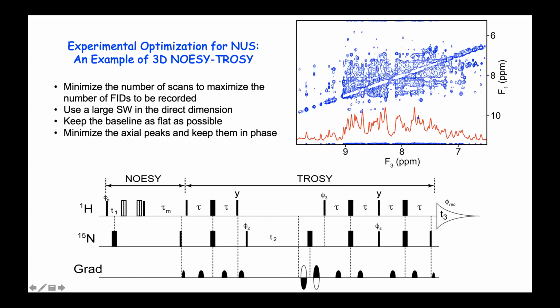So whether this phi 1 is real or imaginary, meaning that you either acquire sine or cosine, you get the same amount of T1 relaxation. And therefore, the real and imaginary parts are equal. So therefore, it's 45 degrees, and your peak is out of phase by 45 degrees. And that's a bit of a problem for me.